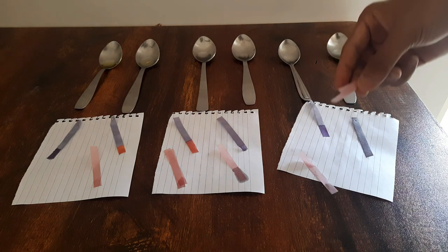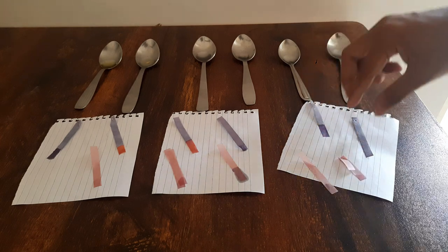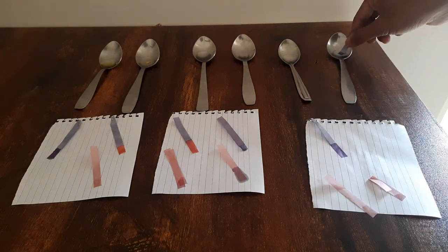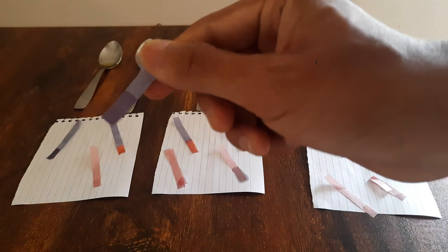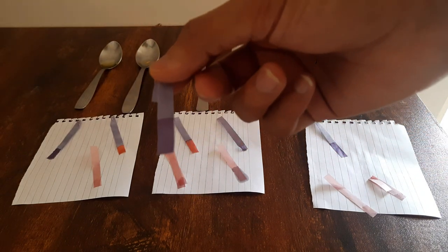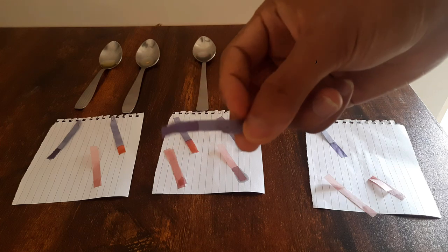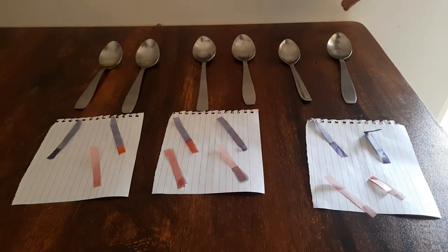No color change with red litmus paper for salty water. And still for blue litmus paper, we do not see any change in color whatsoever, even for salty water. This shows that even salty water is neutral in nature.